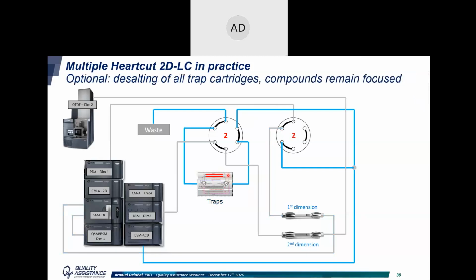Then you have a step of desalting the sample. You have here an additional pump that is used to send either aqueous buffer to your trap column to desalt your sample, or if you want, you can send other types of mobile phases, and we also use it to send DTT on the column to perform online reduction of your samples.